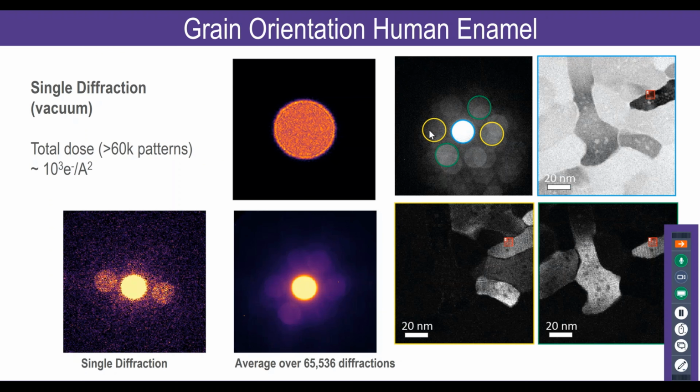And this is a technique called virtual detectors, right? In your standard bright field, dark field images in your standard TEM, you have to tilt your sample, go to two-beam conditions, and repeat that many times to get a complete map of your grains. So with the collection of this large data set of diffractions, you can actually reproduce that bright field and dark field in any fashion here.